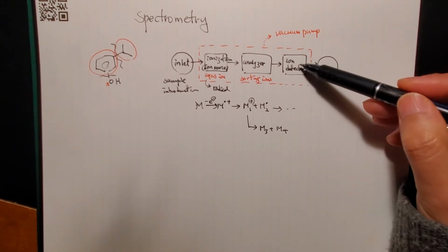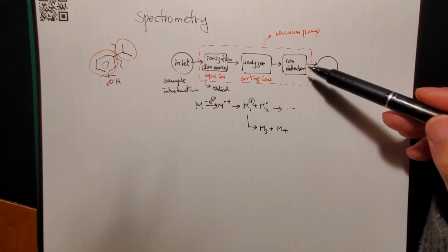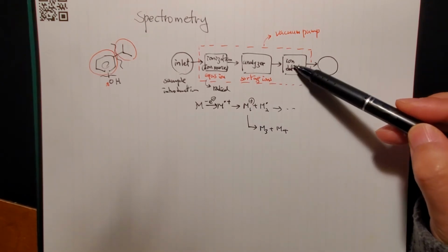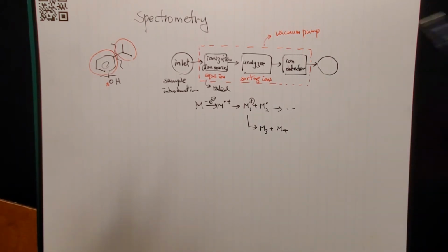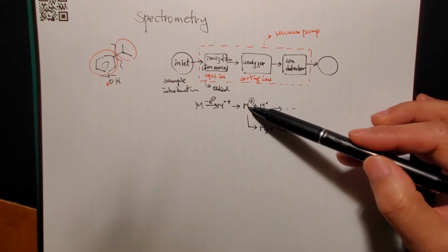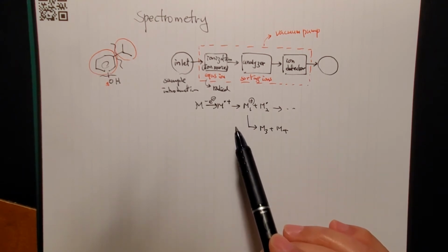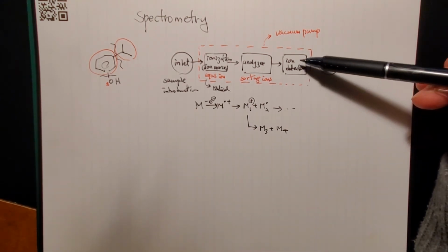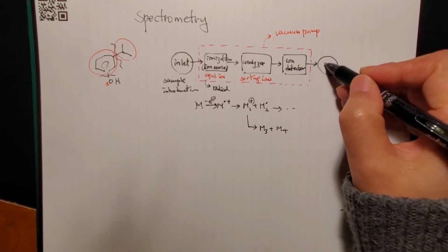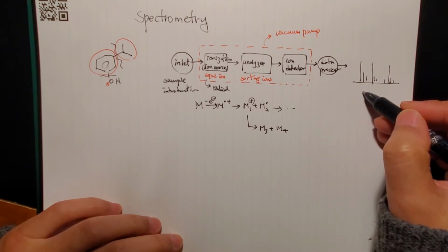So you need to sort them out. Then there will be an ion detector. It's like a little unit where the positive ions come into contact. Then electricity will flow in proportion to the positive ions because they are taking electrons, and the measurement of the current will be converted to data. So the data processor will generate a spectrum.